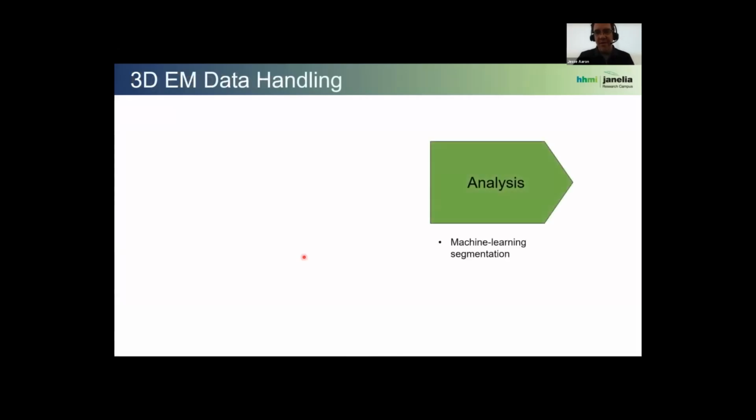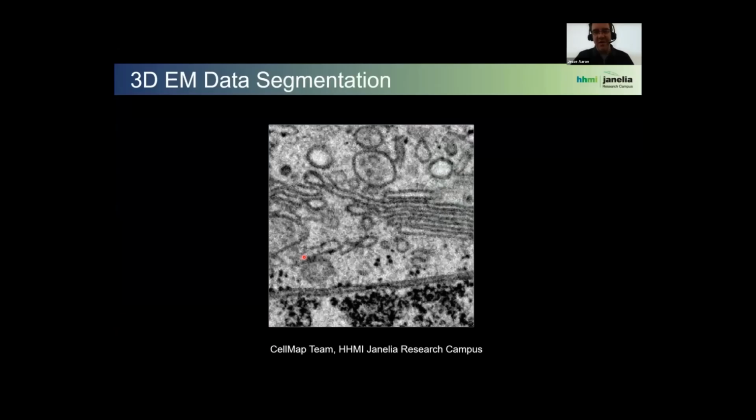All right. So I will hopefully, in the next, let's see how much time I have, about 15 minutes, talk a little bit about machine learning segmentation. And I know this is a big topic. It's the subject of enormous amounts of effort in many, many different fields. And I want to try to parse out exactly what it is we're trying to do with machine learning segmentation, particularly in the context of 3D EM.